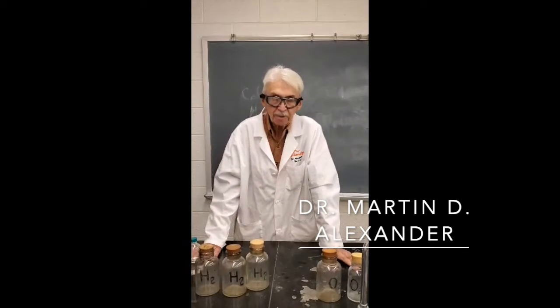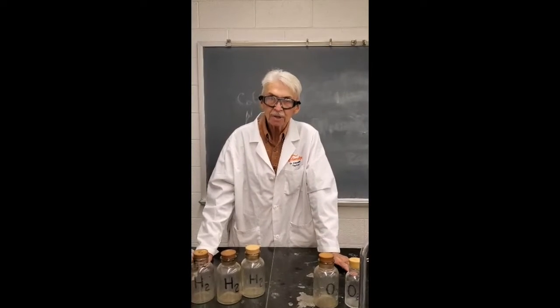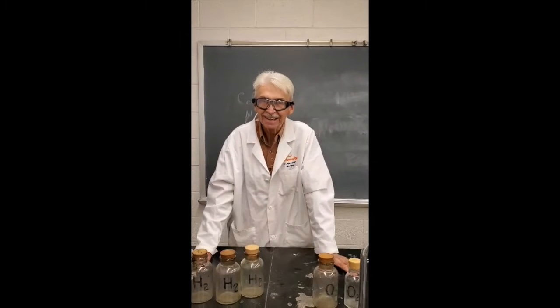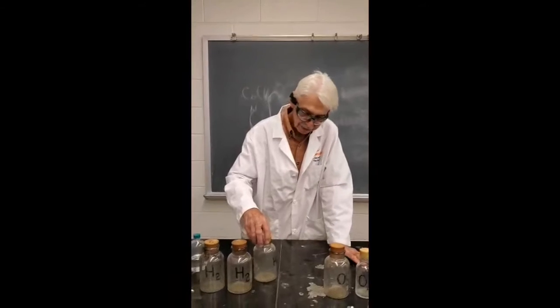I'm going to show you a series of demonstrations called Fun with Gas. Have you ever had fun with gas? Did you ever have gas problems? Anyway, I have some gases here.